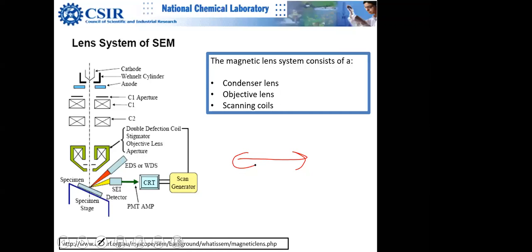So when you put this crow feather in a scanning electron microscope, you can look at the microstructure of the crow feather, and there is very interesting photonics in the way the microstructures are organized. That leads to the maximum absorption of light by crows. That gives them such a dark color, actually a shiny dark color.